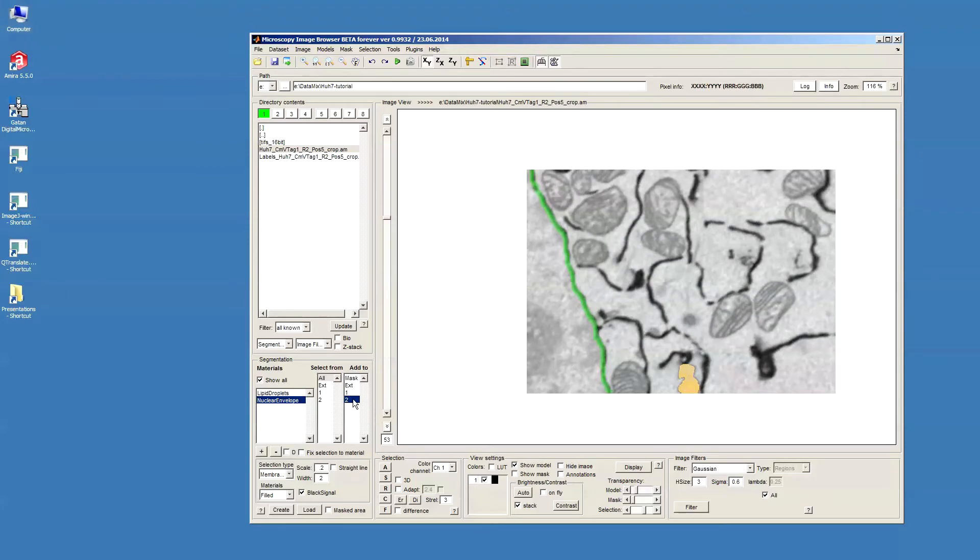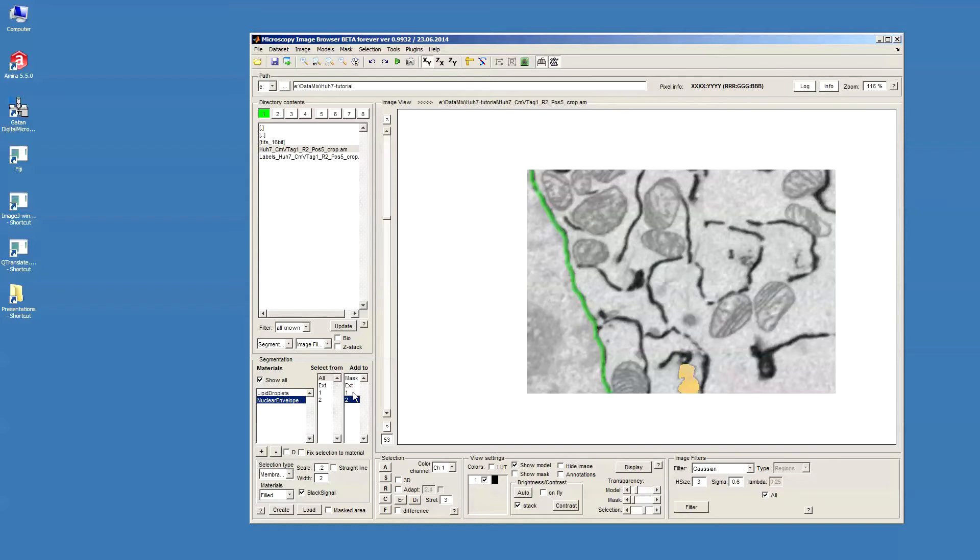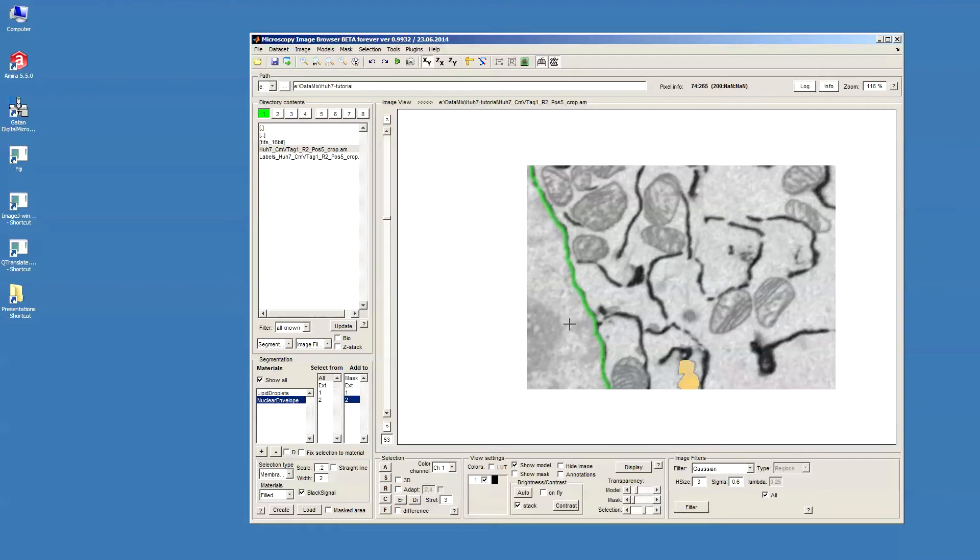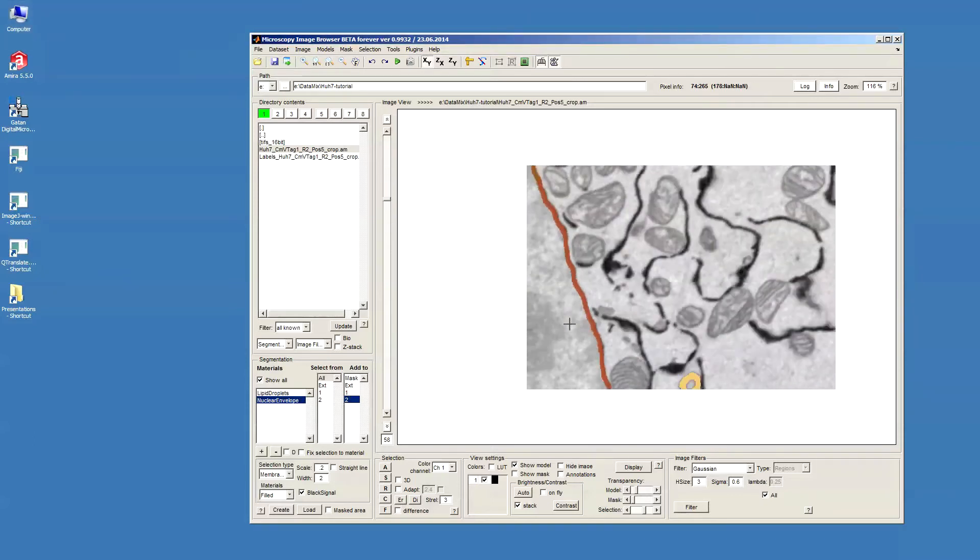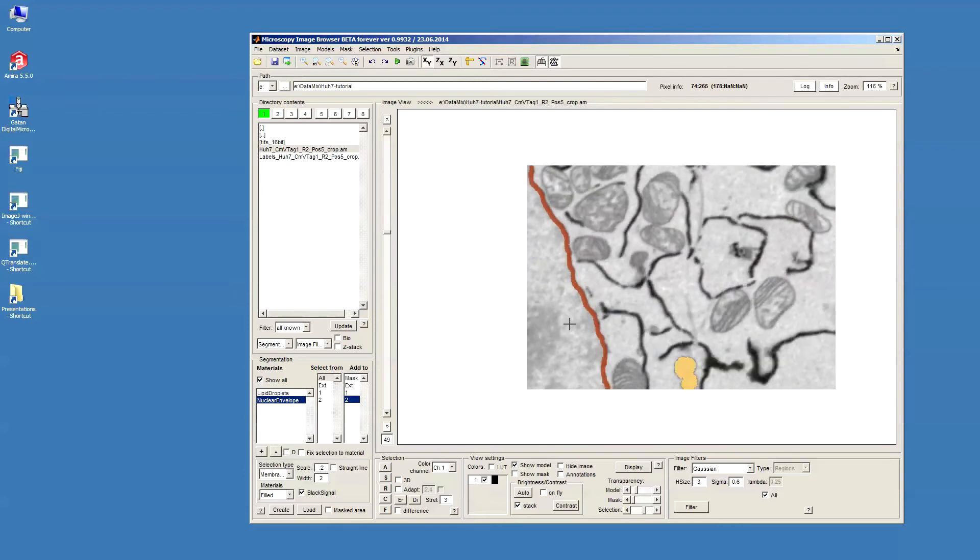Now we will add this selected area to the material that we created in the beginning. We make sure that in the Add To list, the Material To is selected. Then we press Shift A button to add. Now we have the second material.